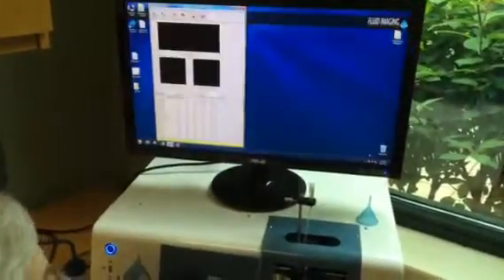So what we're going to do is today's date, 0907, and I think you put a dash in, and then the time, 1427, and then we'll add HTB1 at the end. All set? Sounds good. We're ready to go. Here we go, guys. And go.